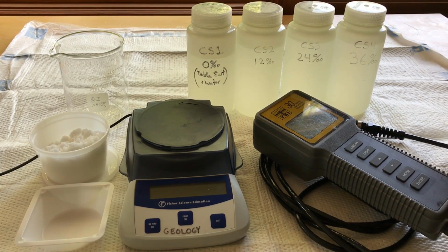This conductivity-based method is relatively fast, easy, and accurate, but neither microsiemens nor millisiemens look very useful for directly estimating salinity. To get from these measures of conductivity to our desired measure of salinity, we need to calibrate the conductivity meter to accurately relay what it measures to what we want to know.